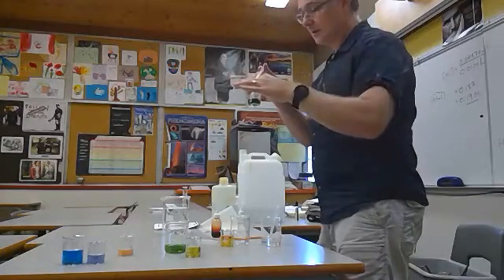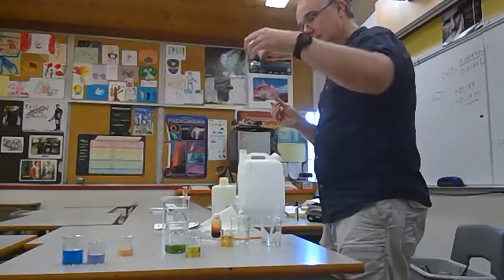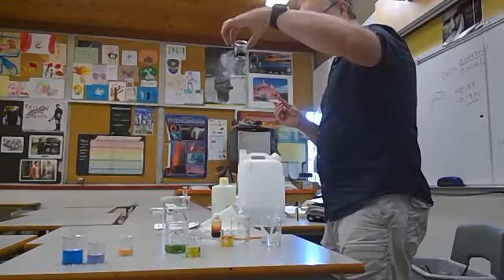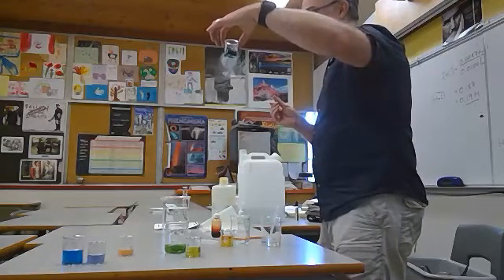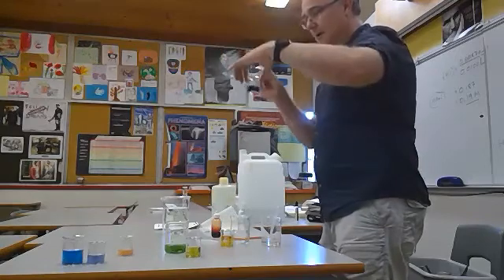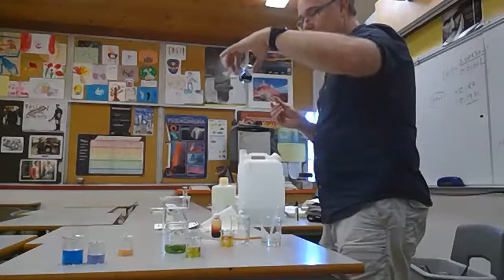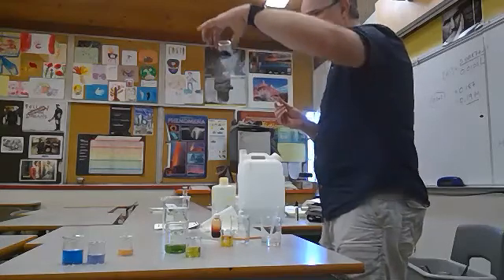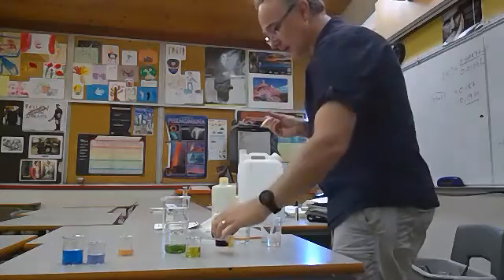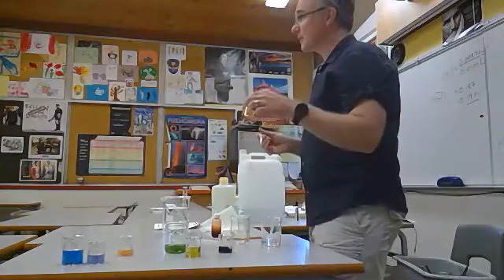If I add another drop, I'm definitely getting a bluey kind of color forming in there. I'm not sure if I can go over that. Yeah, there's the purple sort of form now. So I'm getting purple forming in there. It's kind of hard to see from where you're sitting, but it's a bit more purple there. So this buffer now has been overshot. I've overshot the buffer here.